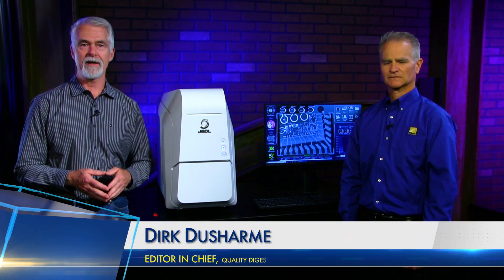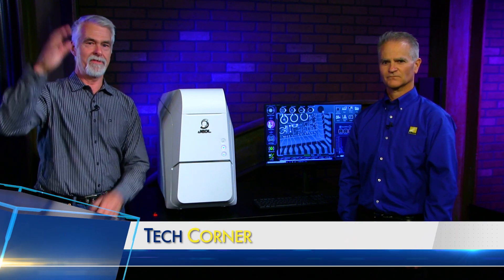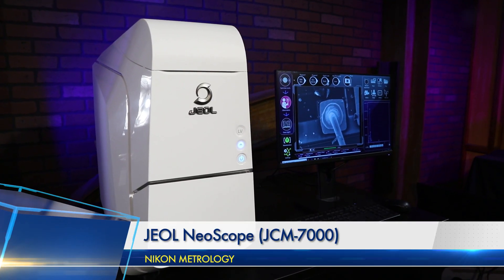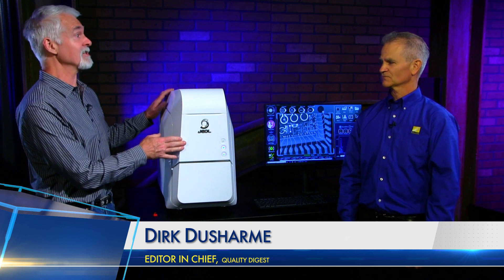Editor-in-Chief of Quality Digest. When Nikon Metrology said they were going to send us an SEM, I was expecting something like the things that used to be the size of a refrigerator. So when this showed up, I thought it was maybe the computer for the SEM. But as Dennis Fenn, Senior Technical Sales Engineer from Nikon Metrology will tell us, no — this is actually the SEM.